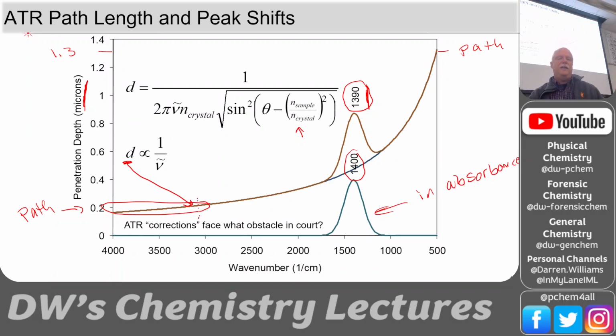And this can be early on. This faced some, it doesn't really now, but it faced an obstacle in court because our databases were absorbance. So the old ones. We had old databases in transmittance that could be converted to absorbance without any shifting. But then if we took spectra using the ATR and compared it to a database that used absorbance, the peaks didn't line up. They were off a little bit. And so then you could say, well, you said this peak should have been at 1400 for drug X, and your spectrum shows it at 1390. Those are not the same number. And you say, well, phooey.